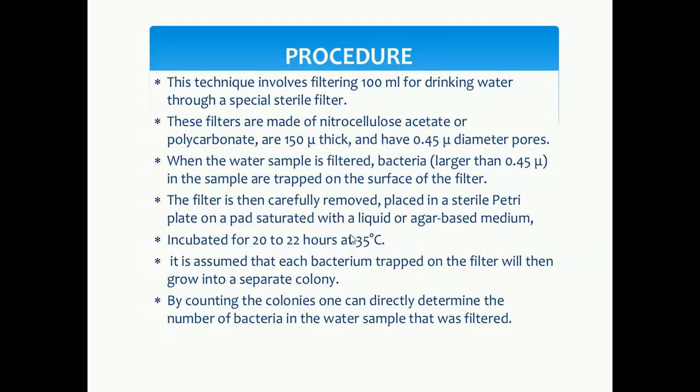When the water sample is filtered, bacteria larger than 0.45 micrometers in diameter in the sample are trapped on the surface of the filter. That indicates that the viruses are not trapped on the surface of the filter.